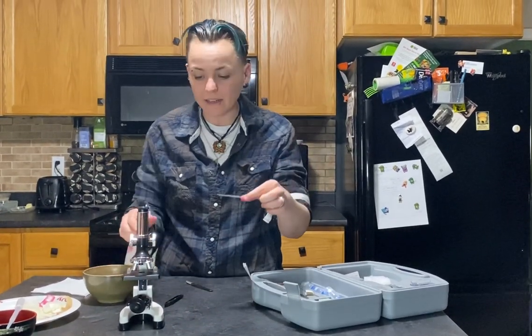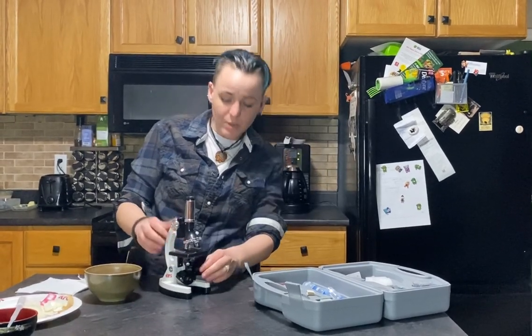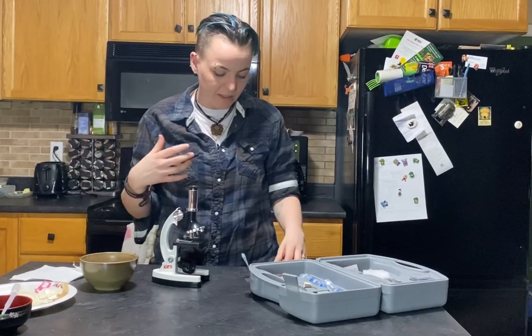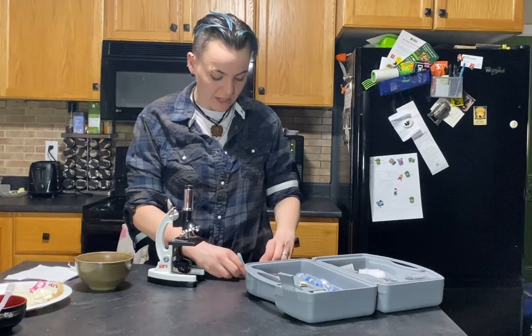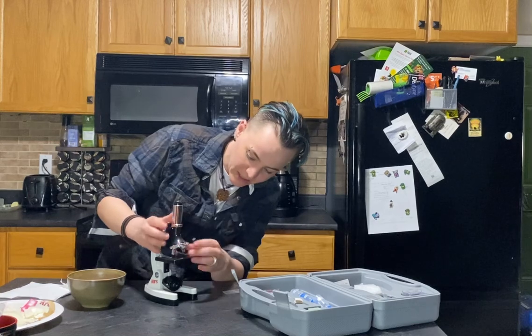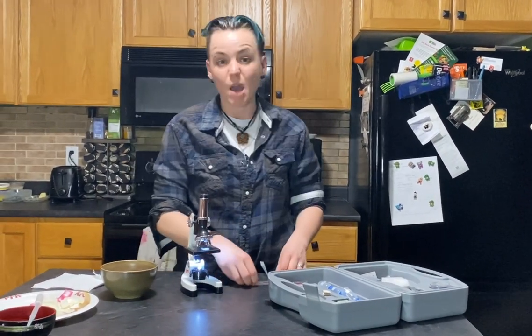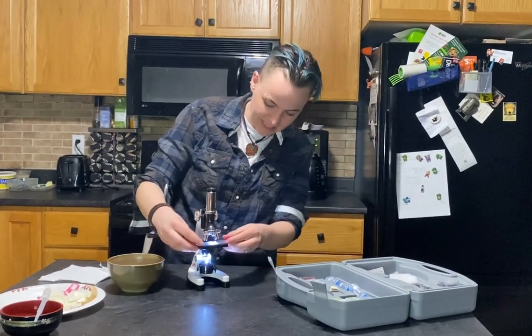Now you have prepared a slide. The next thing we can do is actually look at this under a microscope. As we know, all living things are made up of cells — they're the building blocks of all organisms. I'm made of cells, my dog is made of cells, plants are made of cells, trees are made of cells. And that's what you're going to see when you look at this slide under the microscope — some onion skin cells. The technical name for the cells of the skin is actually called the epidermis, which is what scientists would call the skin.